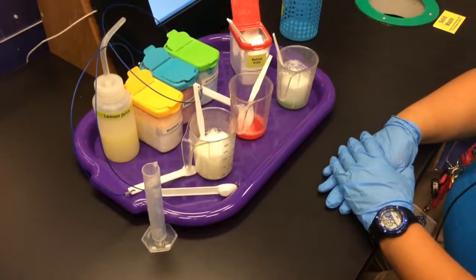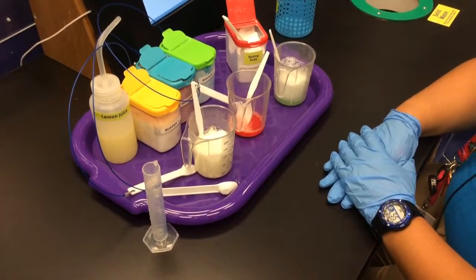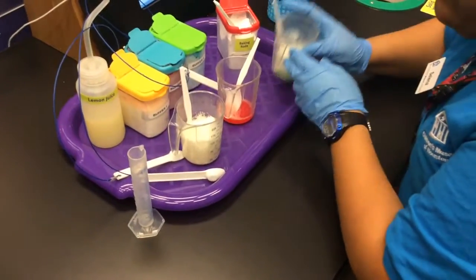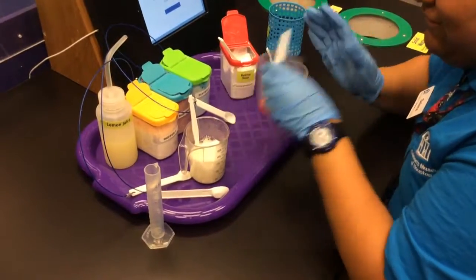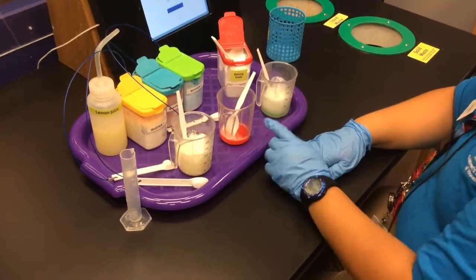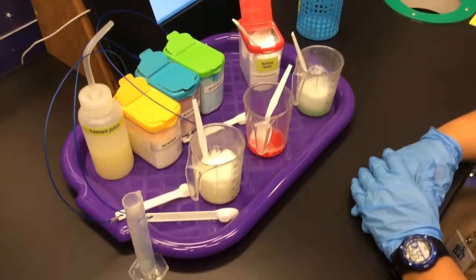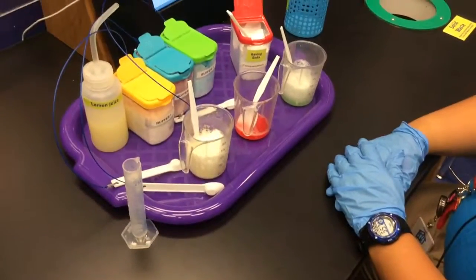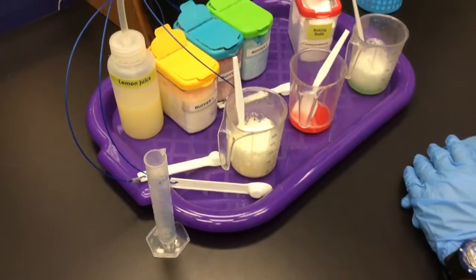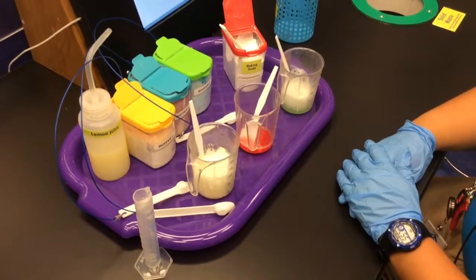Then the last thing at this time, we've looked and made observations. We've also smelled them. Now one other thing we can do is actually listen to see how the reaction is going. It's been about a minute since we've added all of our samples, so Selena, can you lean in and just listen? Pull a beaker close to you, and see which one is making the loudest noise. Yes. One of these two. Those two, okay. Oh, great observation. So Selena noticed that our last two samples are still making noises, which means that the neutralization reaction is still going on. And for the first sample, our first buffer, she didn't hear very much, which means that it's still neutralizing, but at a very, very slow rate.